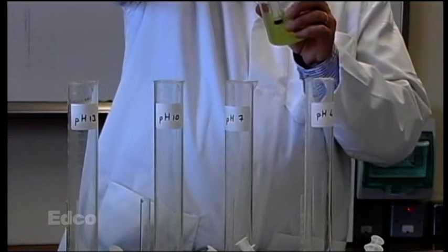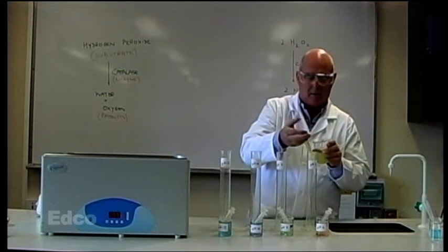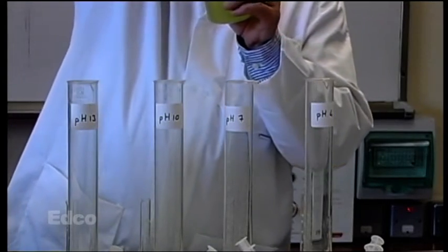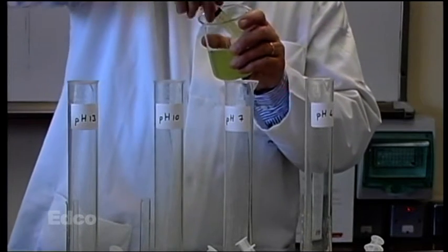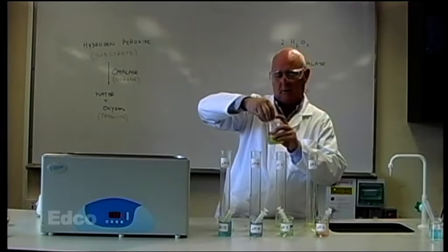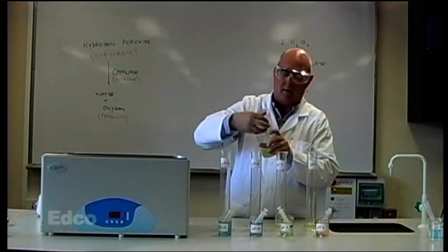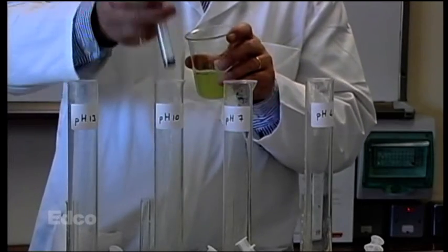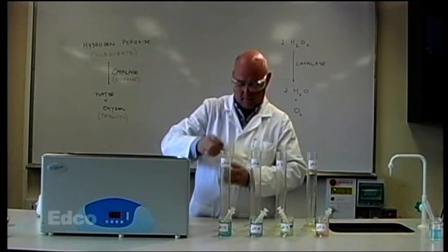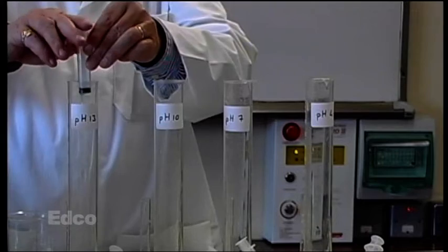So if I transfer in 10 cubic centimeters of this, and into the second one the same again, 10 more. And into the third one the same again. And the same into the fourth one. And that gives us our enzyme solution.